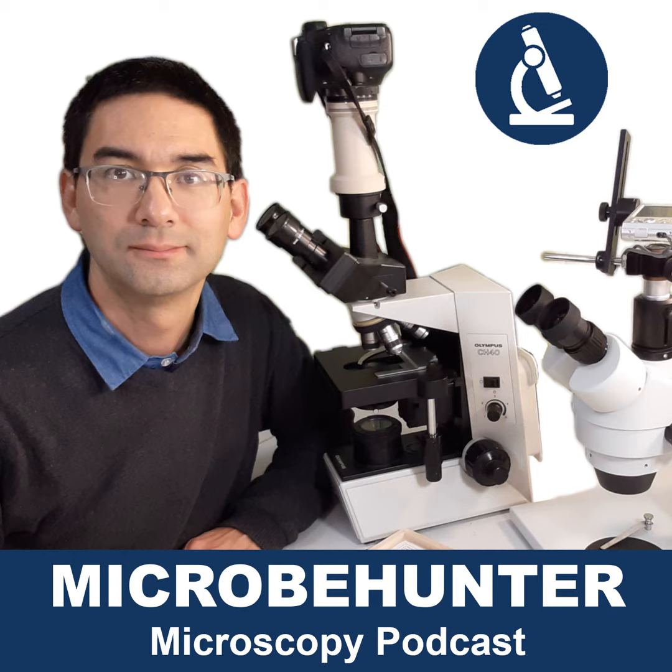Number one, what area to take a sample from, for example, from an eruption, or the site of infection from a sore, nearby or just anywhere, as the infestation is quite extensive. Question number two, should I look for adult specimens or larvae or eggs? Or number three, is there any literature concerning this endeavor? The list could go on, which is the reason I can't get any assistance.